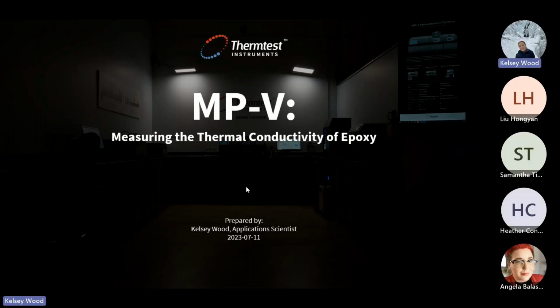Thanks for the introduction, Angela. So as she mentioned, today we're going to be talking about the measurement of different types of epoxy using the measurement platform Versatile and the transient plane source method.